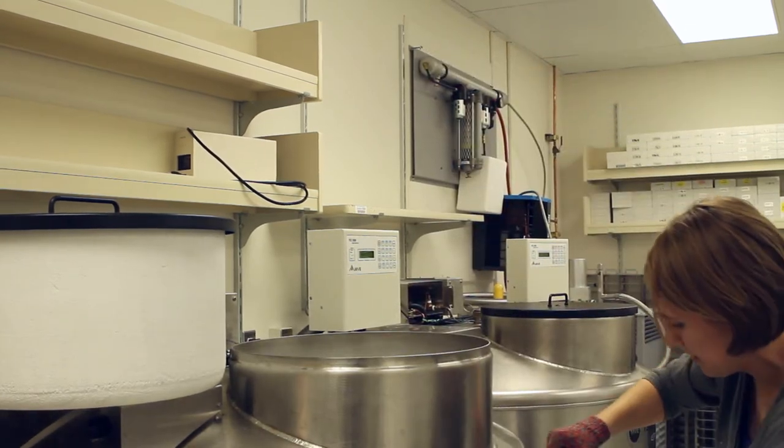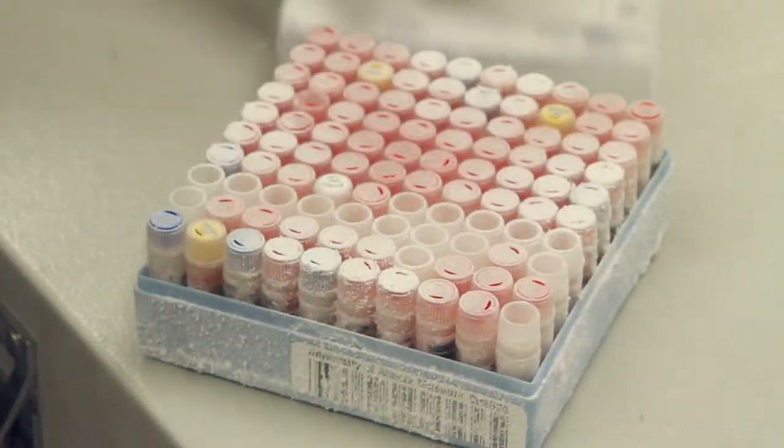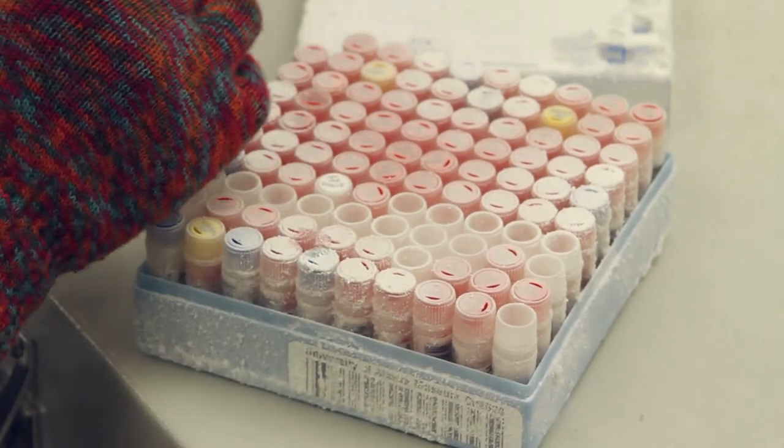They're labeled, so they'll tell you the number with the barcode, what type of tissue it is, and then all the different colors on the caps indicate different tissues. For instance, purple is brain, red is traditionally heart or tissue, blue is muscle.